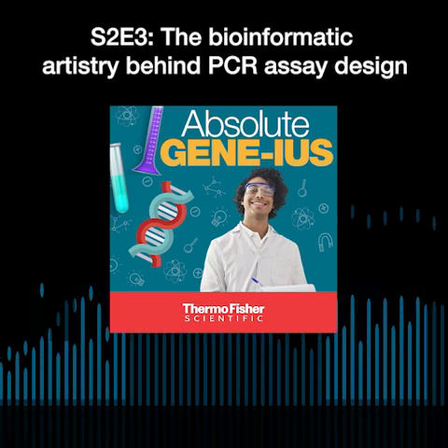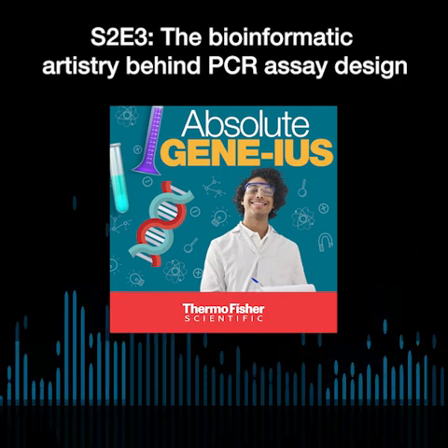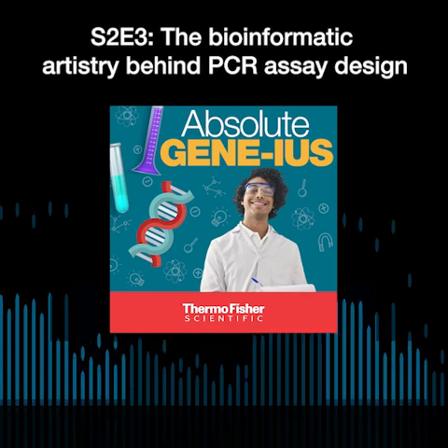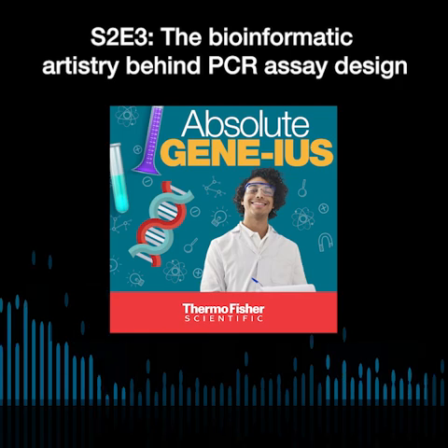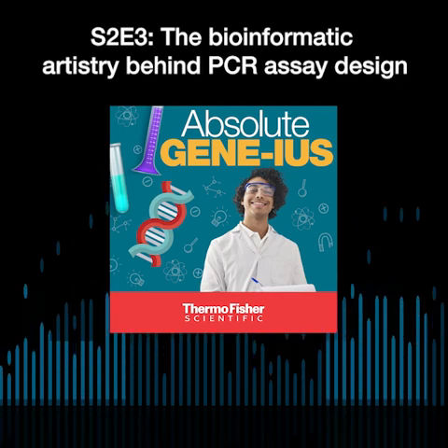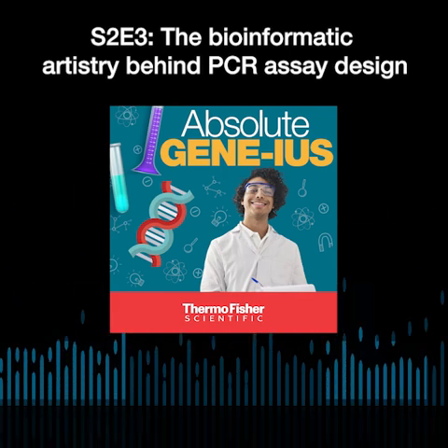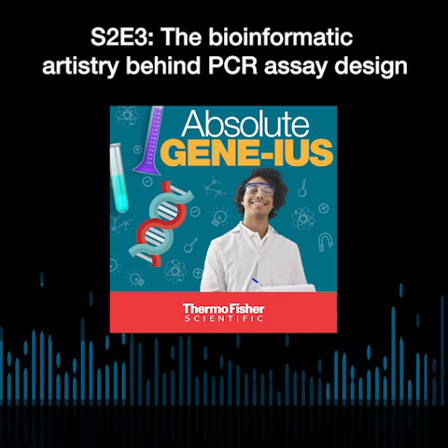So for digital PCR, does reaction efficiency play as large of a role as it does in qPCR, in real-time PCR? It does, right? Because you have very few templates in every chamber. So, with that respect, reaction efficiency would be a key factor in making sure that we do get the signal that we're expecting towards the end. And since we do take pride in the fact that we can detect low copy number targets, that also makes it important that the reaction efficiency is good.